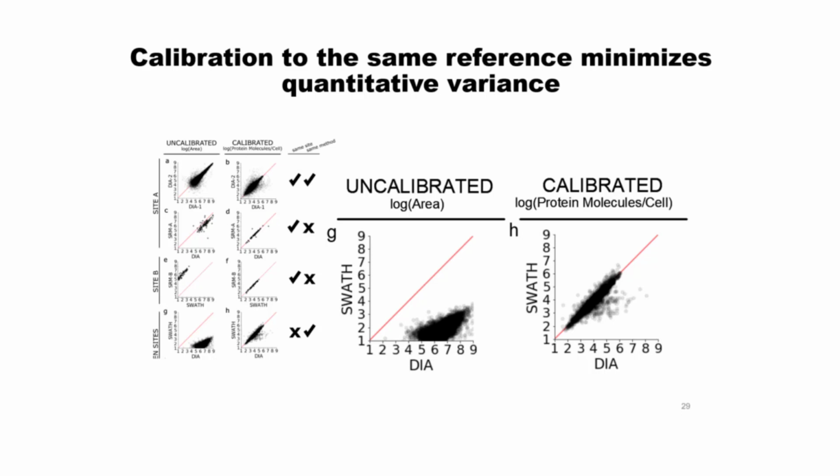Yeah. So I'll point out, this is exactly how, when you go and get blood drawn and you get measures of proteins measured, it's how the ELISAs are calibrated. They are calibrated relative to a common pool of plasma sample. There is no spike in for an ELISA, it's just a signal. They have a single point external calibrant that they calibrate that protein level to, and everything's measured relative to that, and then that common reference is given a number either by some calibration values from the manufacturer or from NIST or et cetera. So that's how it's done. So we're using an external single point calibrator.